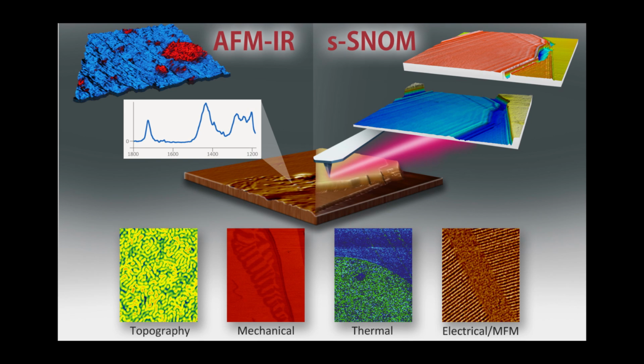You want to see that interaction between the tip and sample throughout the entire oscillation of the tip cycle. The tip is tapping, moving vertically away from the surface of the sample and returning to the sample, and you want to interrogate the scattered light throughout that motion. So having a lower repetition rate source would be a challenge for scattering SNOM and is typically not used. You need either a quasi-CW, a high repetition rate, or a CW source for scattering SNOM measurements.